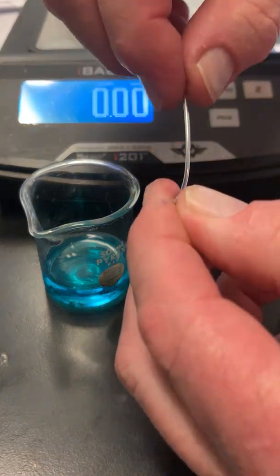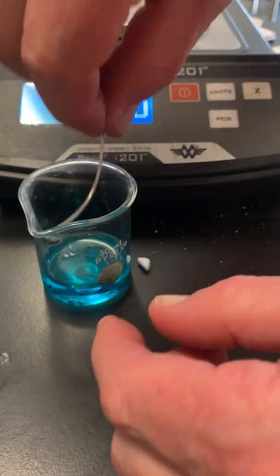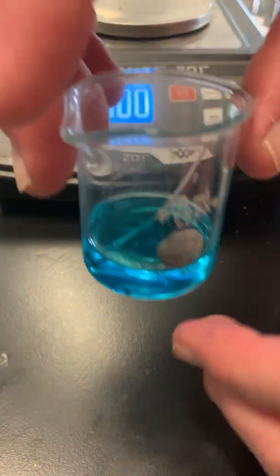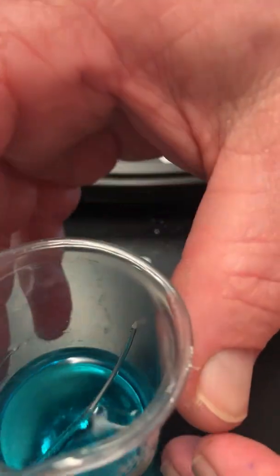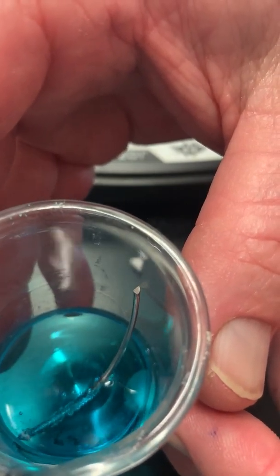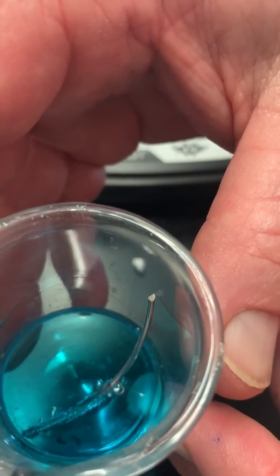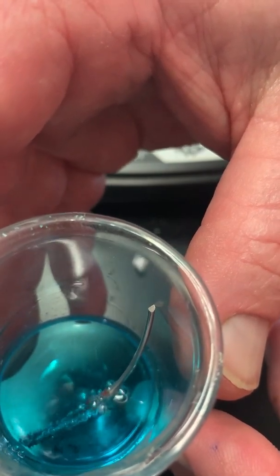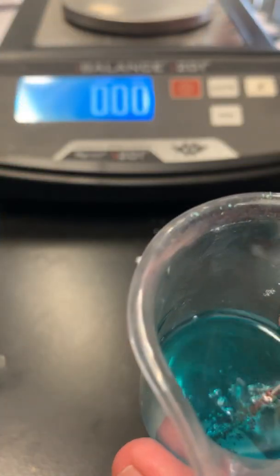We're supposed to curve it, so that a lot of it gets underwater. So when I put it in here, it will be underwater. So there we go. Push it down a little bit. Now it's in water. Now you're supposed to observe the reaction. So hoping my camera will focus. So we see some bubbles. Some people made solutions that were very, very dense, and they bubbled a lot, and they fizzed, and they got very warm. I don't know how warm this one will get.